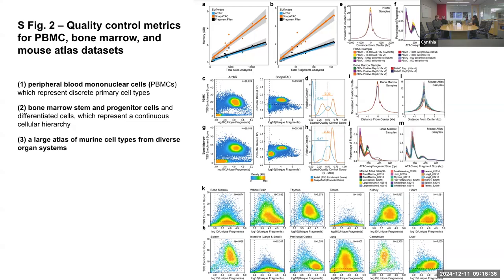And you can see here this metric that is very relevant in this kind of analysis, the transcription start-site enrichment score. We can see it in this plot, which shows the general distribution of this enrichment score metric. Here in the yellow, we are expecting to see, as a regular recommendation, a TSS score around 7, let's say. But you can see that there is a really big difference between different kinds of tissues. One that most caught my attention was the testes, because it is really around 2, probably 1, as well as other methods that have really high TSS scores.